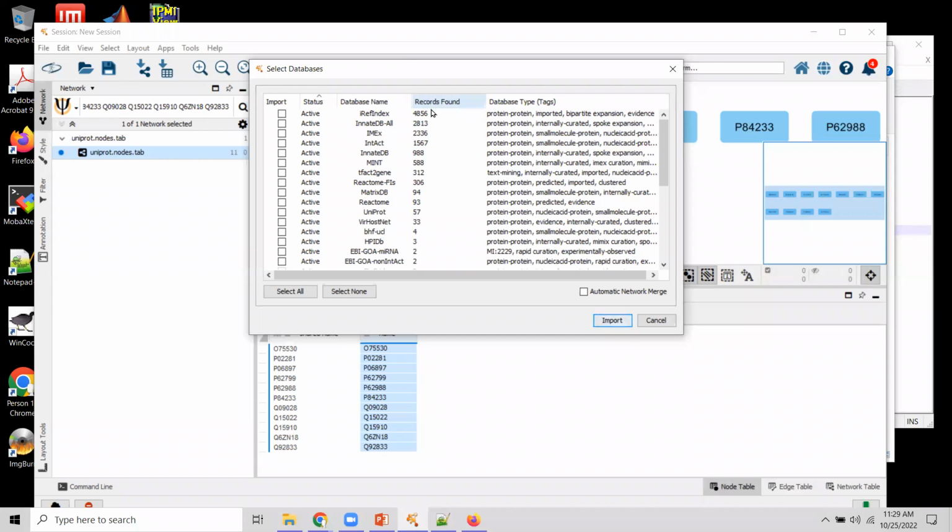Because of my personal connections and preferences, I do like IMEx. Let's say that it's going to come out why tomorrow, but this is my go-to source of interactions if I've got to get it this way.